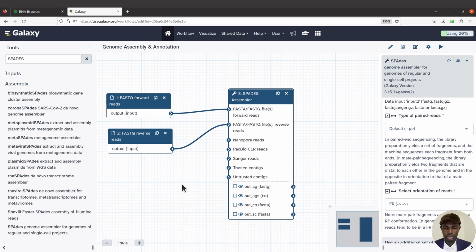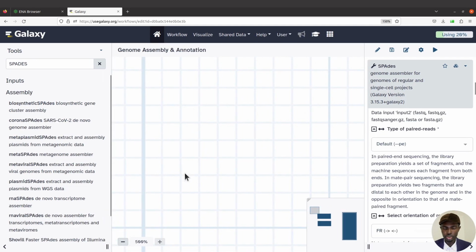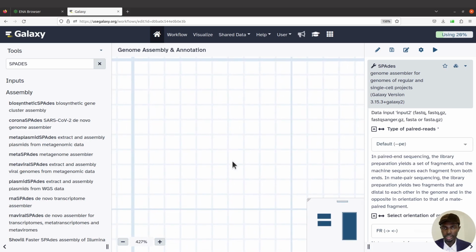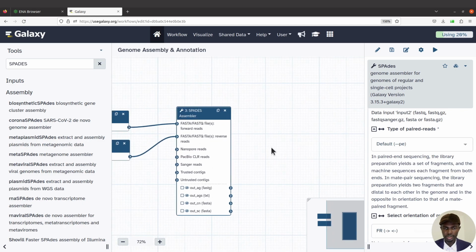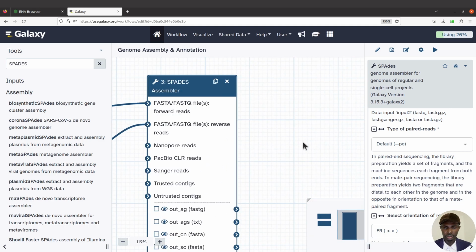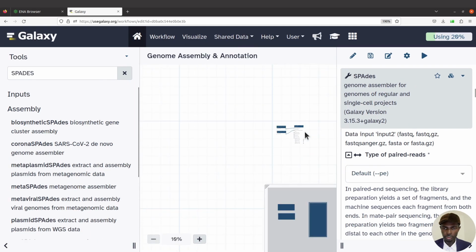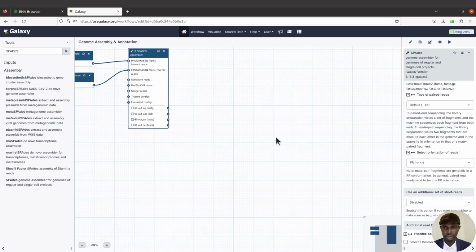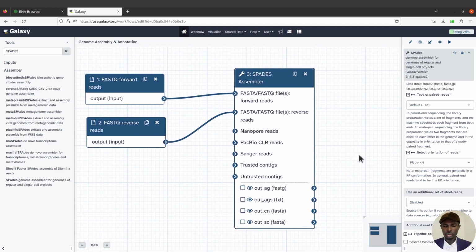Okay. So now you can also zoom in and out. You can use your mouse to do that. If, let's say, it's too small or too large, you can always zoom in and out. So take note of that. Now I'll just zoom in again. Let me see. I'll zoom in to make it larger a bit. Let me try once again. Okay, perfect. Let me reduce it a bit again. It's too big for me. I think I'll do it from the browser here. Yeah, this should be fine. Okay, now we are here. So let's do this.